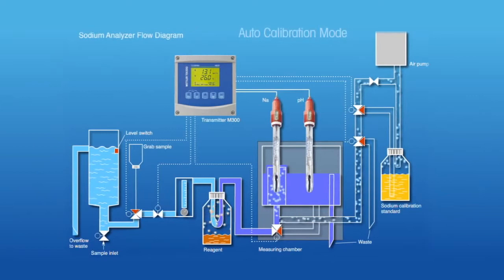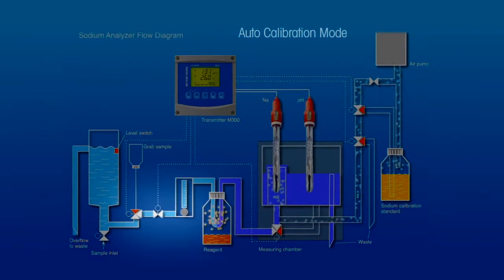The Thornton 2300NA sodium analyzer provides unattended automatic calibration, a valuable time-saving capability. Starting the auto-calibration sequence, the valve at the left stops the sample flow.